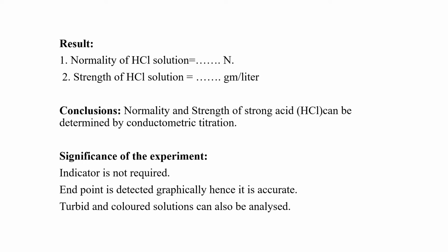The significance of this experiment is, indicator is not required for this titration, and end point is detected graphically, hence it is accurate. We can also perform the titrations for turbid and colored solutions, and we can analyze them. I have attached the video of this practical. You can watch it and understand well.